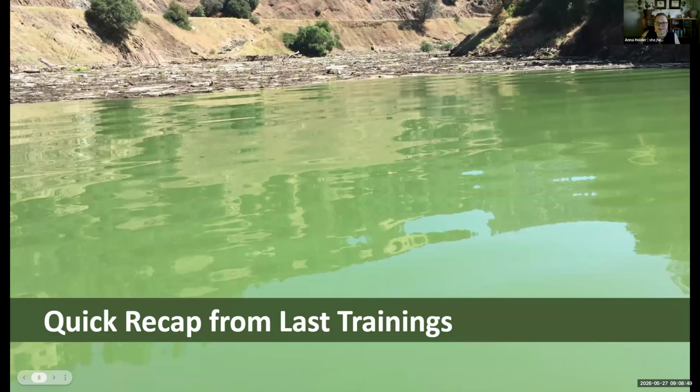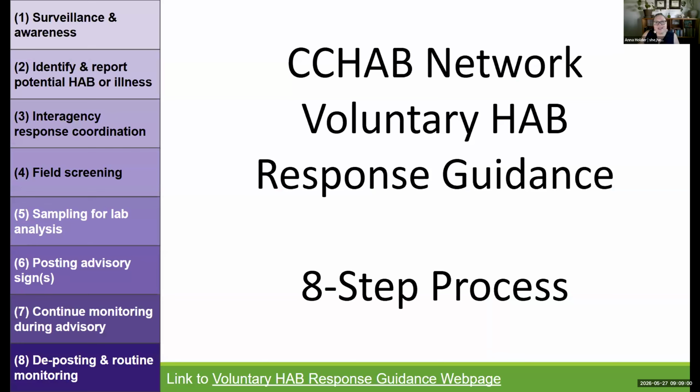Okay. This is where I need to pay close attention because I'm supposed to know a bunch of stuff here. So now, real briefly, we're going to do a quick recap of stuff we shared in one or more of our previous trainings that we think will help ground us all to jump into today's topics. So we're focusing on sample collection and a little bit of analysis today, which is foundational to any monitoring program, right? You go out to monitor and you need to collect your data.